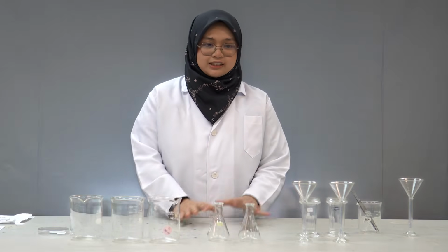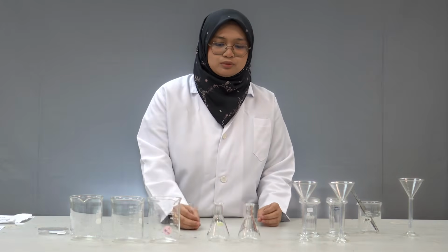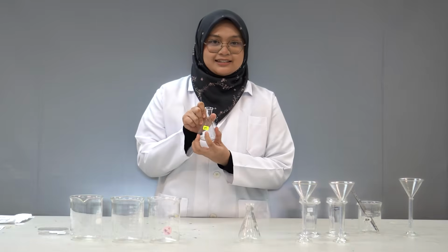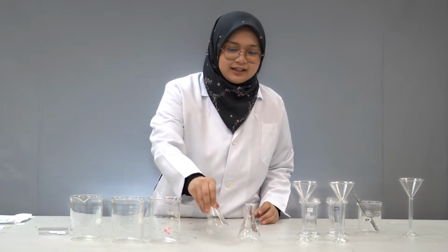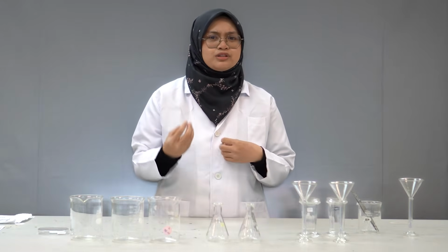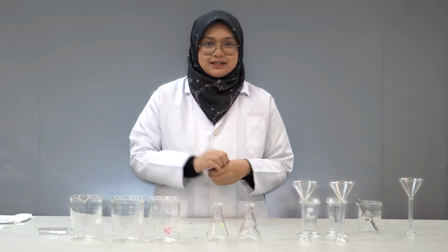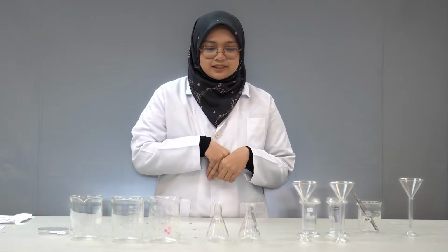Next, all the items that we have, we must label first, just like this. We have to label them. Why? Because we want to make sure there is no confusion, misuse, or mixing of random chemicals.